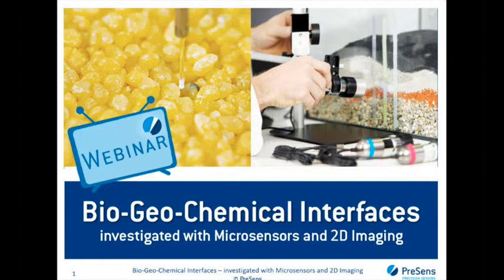Today we're going to talk, first of all, about the importance of bio-geochemical interfaces and what kind of processes take place in there, but also two measurement techniques from our company, microsensors and 2D imaging, and how they can be used for investigating those interfaces. Then we will hand over to some practical examples, rounded up by a question round.